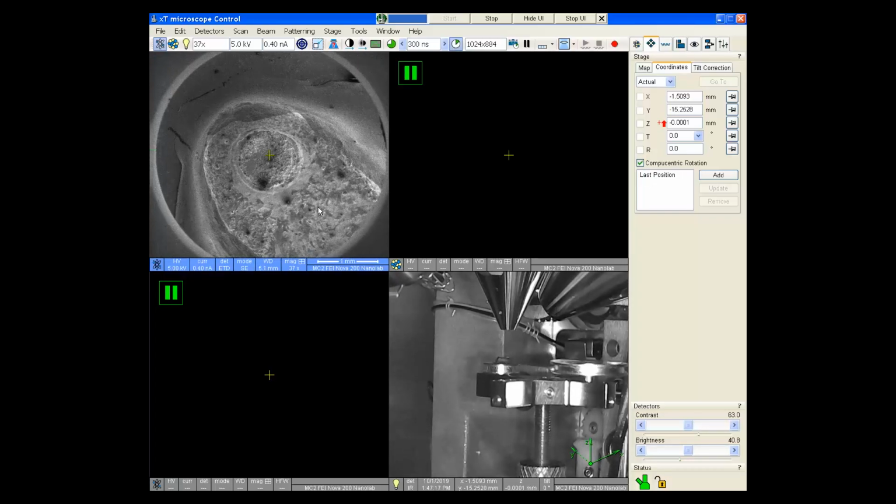Now, if the image of the sample surface happens to be in focus, then that number is a very good way to measure the distance. However, it requires the surface of the sample to be in focus. If that image is not in focus, then this number is meaningless.